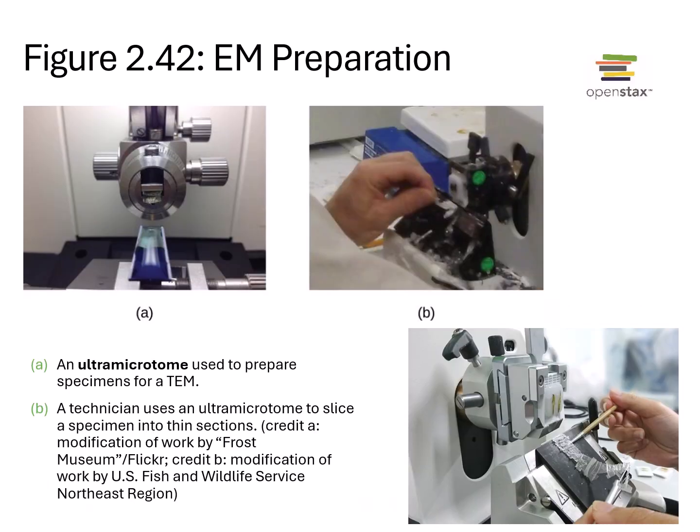So I cut out a lot of the end of the textbook in my slides. I'm not going to go over the check your understanding questions for some of these, but I did want to bring up some aspects of the last part of 2.4. One is an ultramicrotome. Before I talk about the ultramicrotome, let's talk about a regular microtome, shown here at the bottom right. It is an instrument used to make really thin slices of your sample.